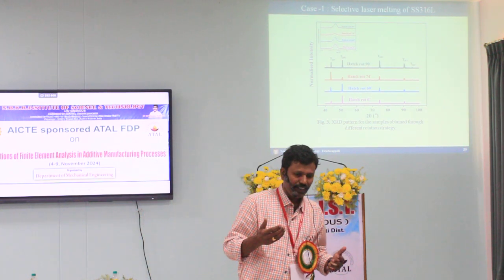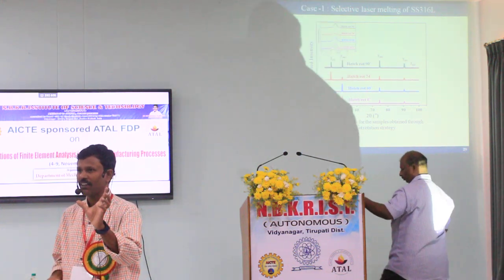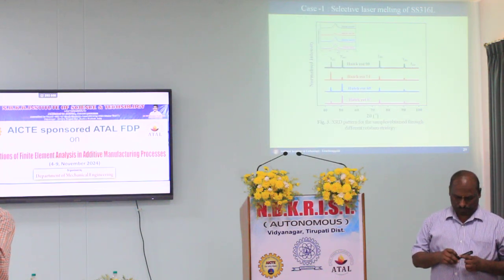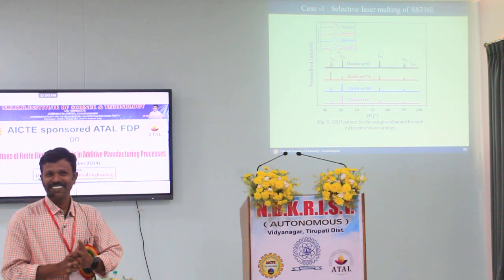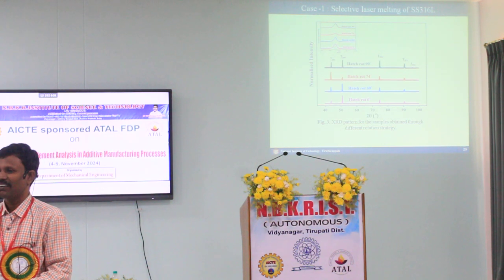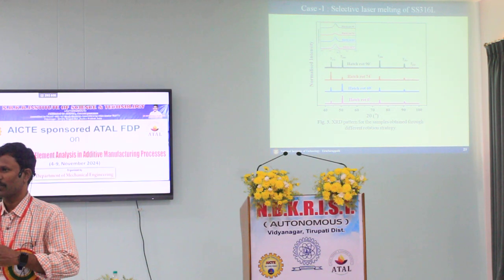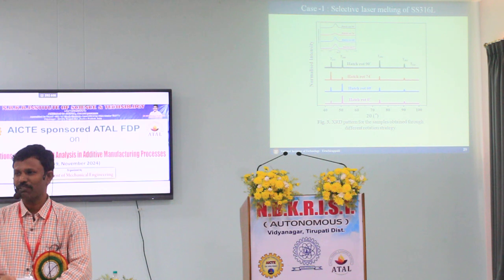Many people, when I was in charge, used to say, sir, I want to see what all the ingredients are. The terminology I used to hear was very funny. Sir, I want to see the ingredients of this one. Hearing that, I used to ask what kind of ingredients he was expecting. He used to say, sir, it is an aluminum alloy, it is not this, it is that. So I want to see what all elements are there. He used to come to XRD. XRD cannot do element analysis. Go to spectroscopy or similar.